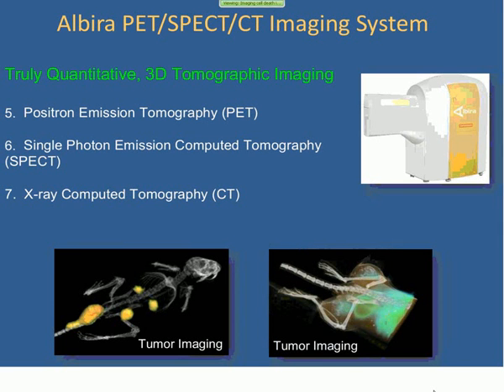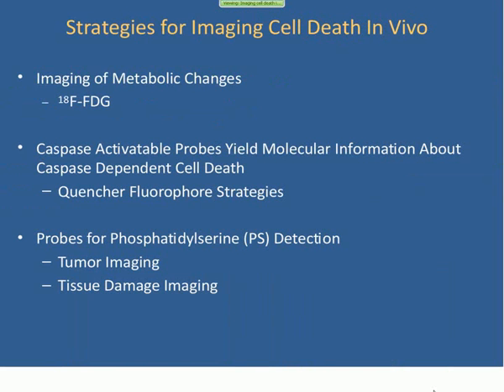So while this is a rapid and convenient planar imaging platform, Carestream now offers a 3D platform through the use of the Albira tri-modal system. And of course the modalities offered here, as I mentioned before, are PET, SPECT, and CT, and I've shown a couple classic examples down here below where now you're again using the X-ray anatomical scaffold, and you're then superimposing your molecular signals emanated from radio tracers in the PET or SPECT modality.